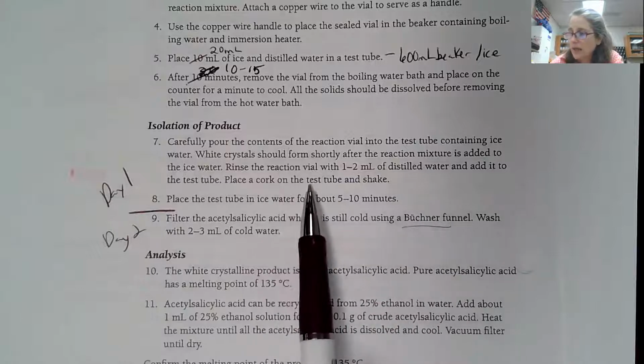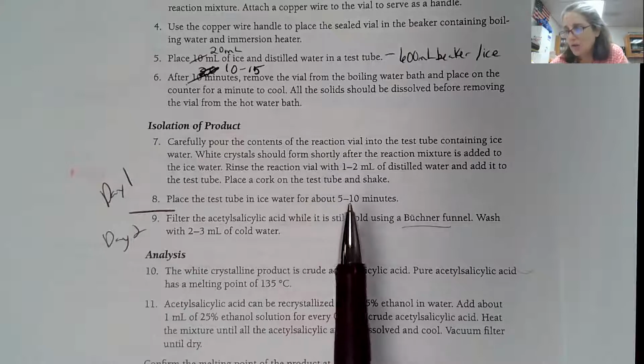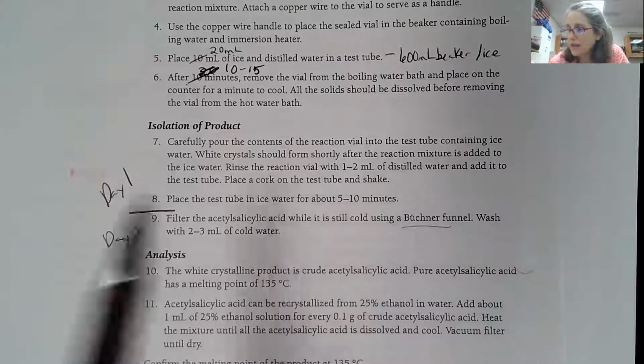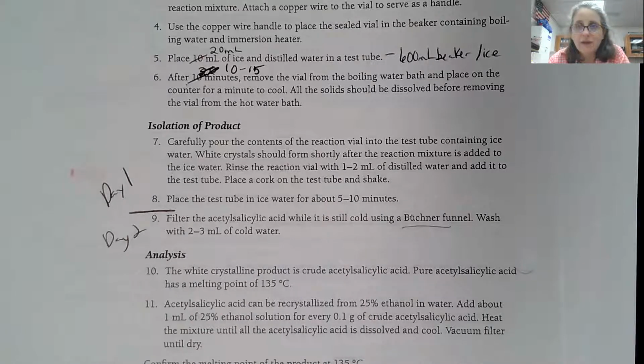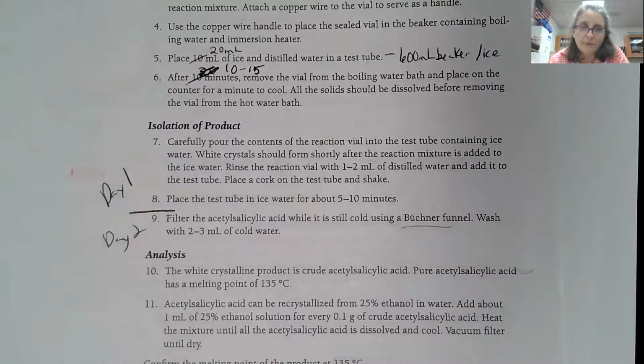You're going to then put the stopper on the top of the test tube and shake it, so it needs to have some agitation. And then you're going to put the test tube in the ice water bath for about 5 to 10 minutes. And this would be what we could accomplish on day 1.